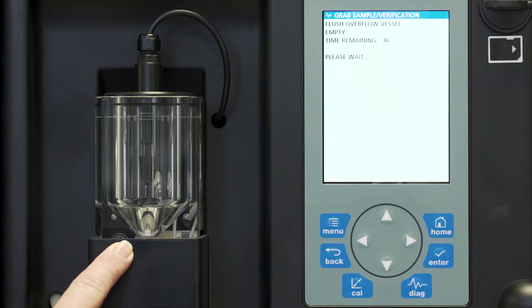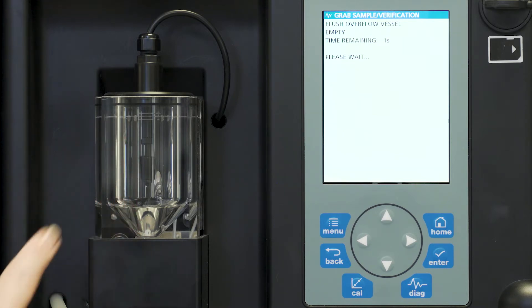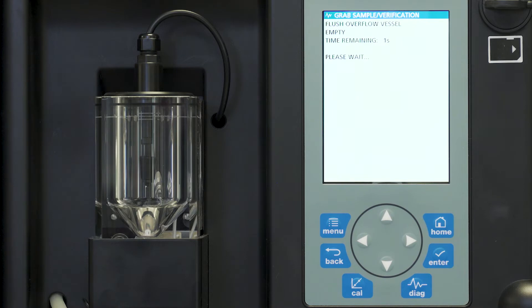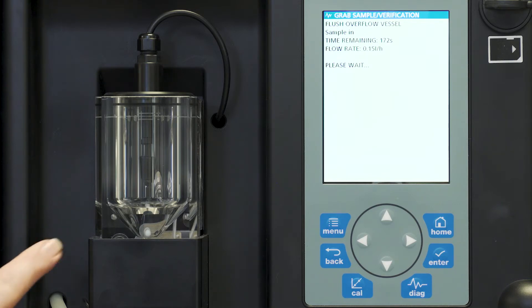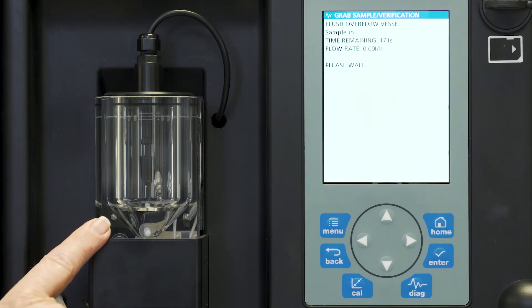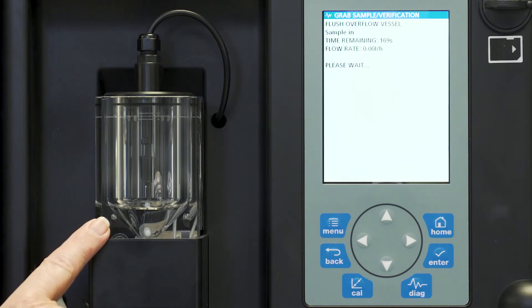You will hear the pump go and it will return on and refill this overflow chamber with water again. So now we're in the flush overflow vessel, sample in. It's now starting to refill this overflow chamber with your water sample for a final flush.